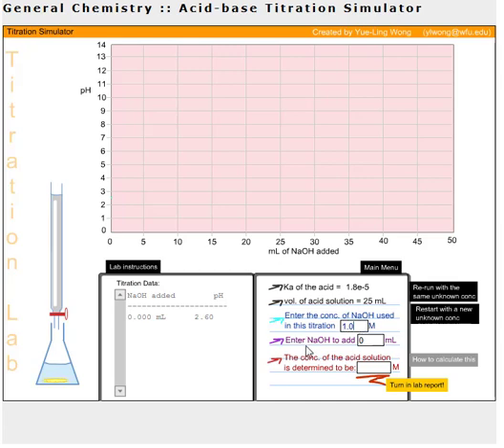The next thing you need to set is the amount of NaOH, the volume that will be added each time you click on the burette. And that's referred to as an aliquot. And so initially for the first titration, we're going to set that to a pretty high number, about 5 milliliters at a time, because we just want to get a rough idea of where the endpoint is. And then we can rerun the titration, make it a smaller aliquot size, and get better resolution. So I've set my titrant to 1 molar. I'm going to add it in 5 milliliter increments. So to add it, I click on the burette.